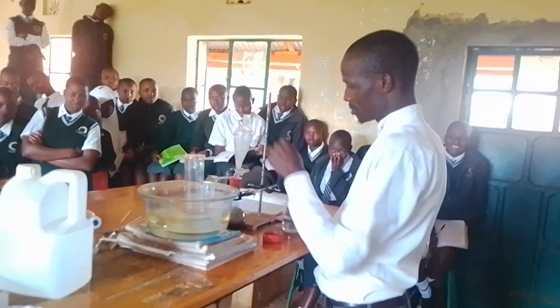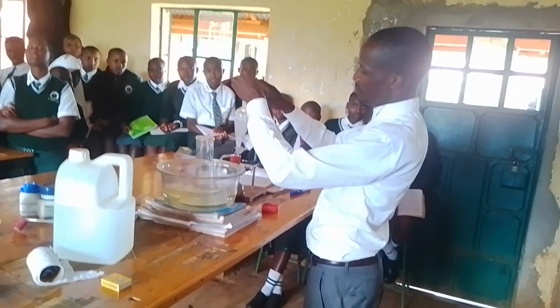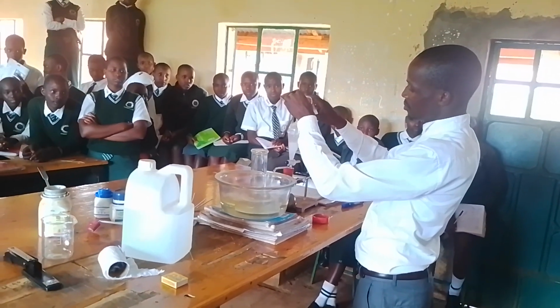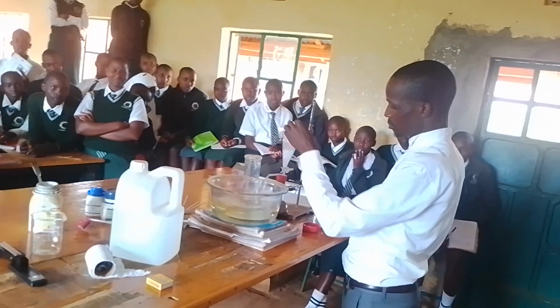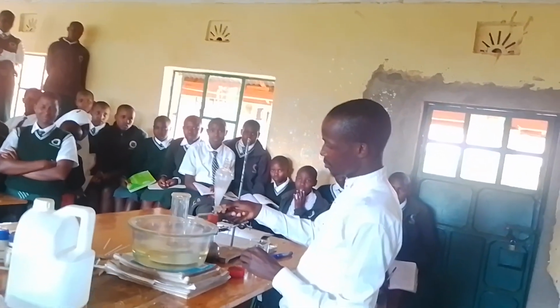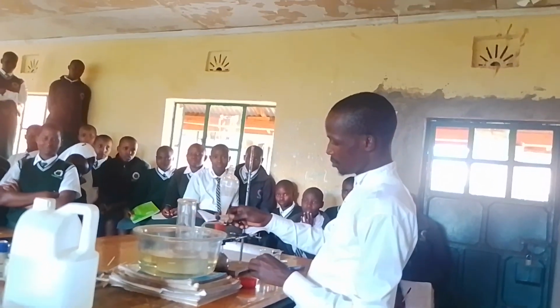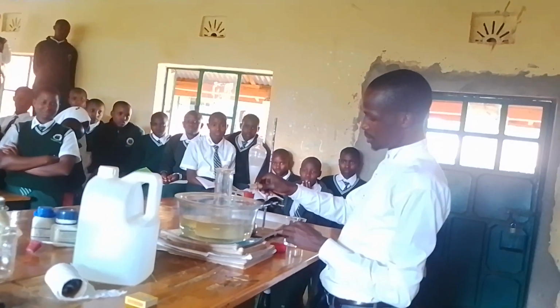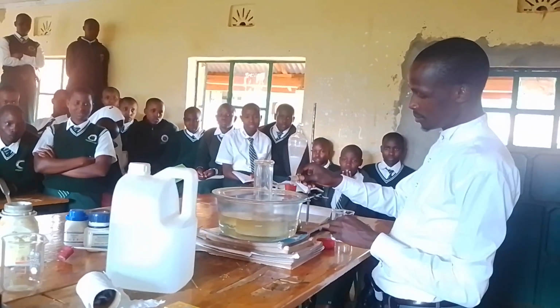Are we there? Yes. Maybe I can still add a few. You see, immediately when hydrogen peroxide goes to the other side, what happens?